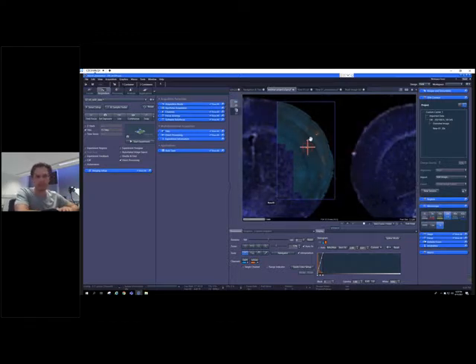re-investigation of the sample. So after a very quick and straightforward alignment of our data, which is also supported by a wizard, we can directly come back to the positions that we want to drive to. And of course, it's a tool for correlative microscopy, so allowing us not only to bring samples back onto the same microscope and put all the data into a single project file, but also allows us to bring data to another light or electron microscope.